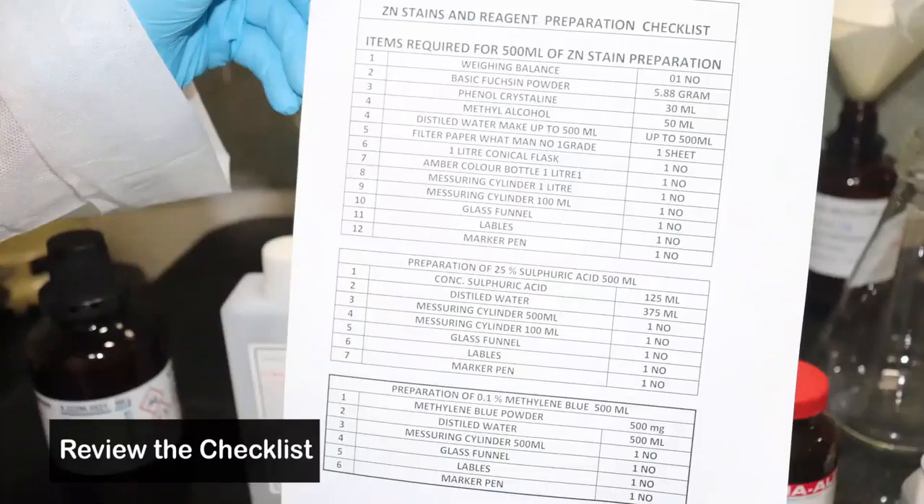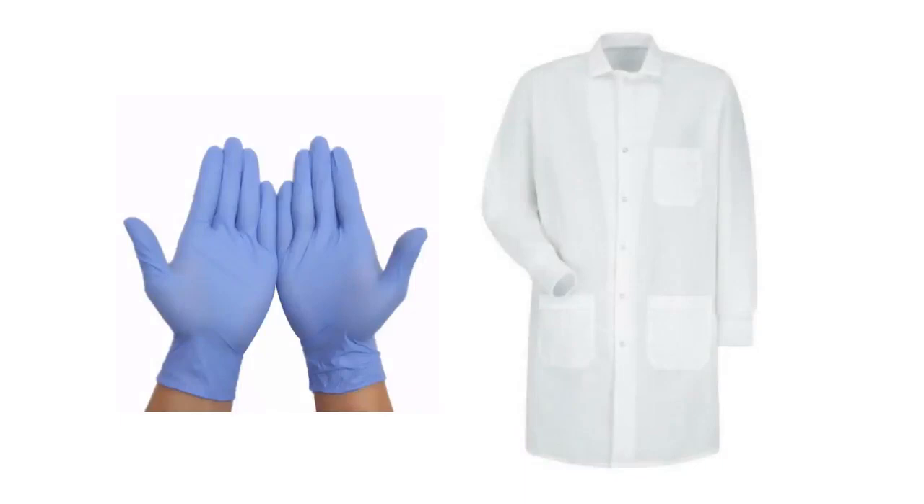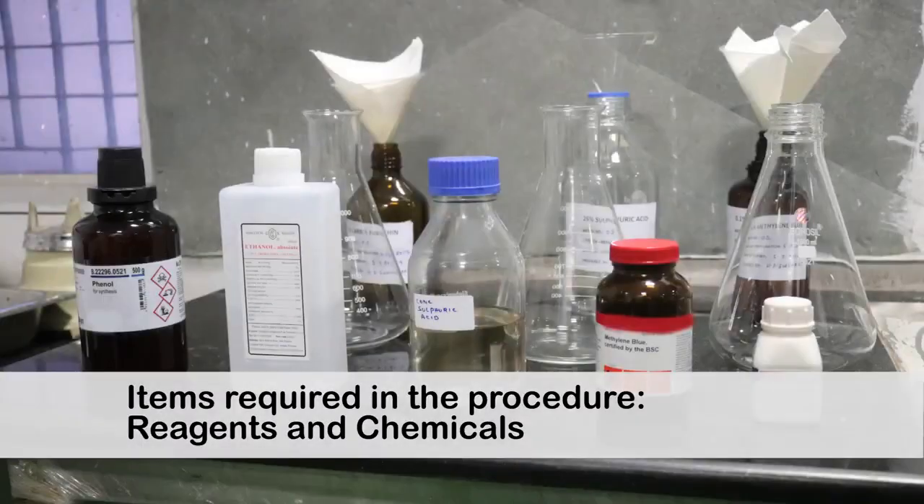First, review the checklist. Make sure you wear the appropriate PPE before starting the procedure. In the next section of the video, you will review the equipment and chemicals used in staining reagent preparation.